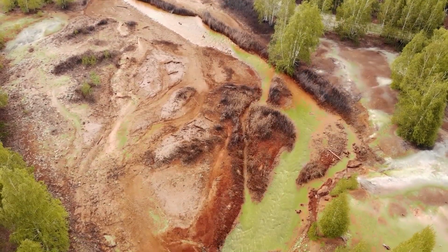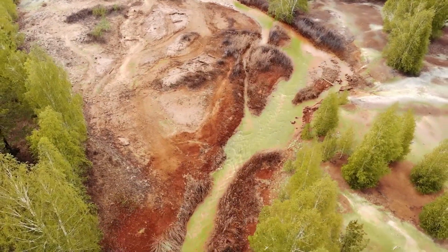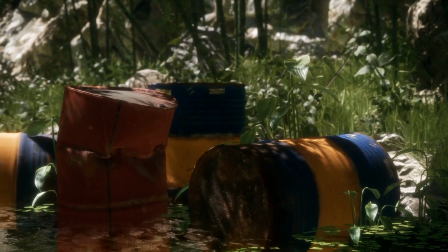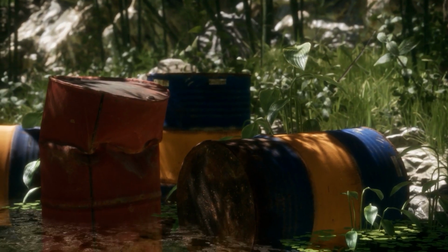You could be on site digging a borehole and some green slime comes out of the ground and you want to know what it is. Or you could be doing a clean-up campaign and you've found loads of barrels of solid or liquid where the labels have fallen off and you have no idea what this material is. This is where our characterisation of unknowns comes in.